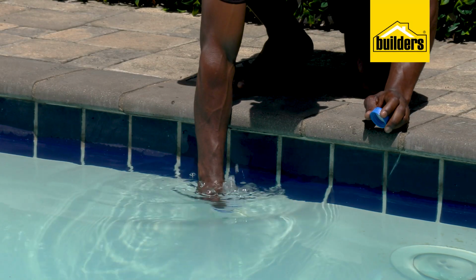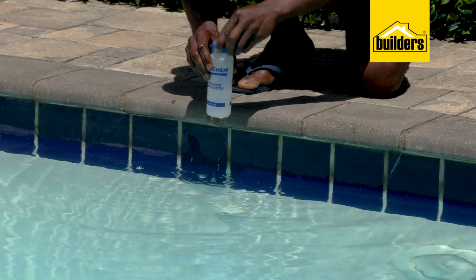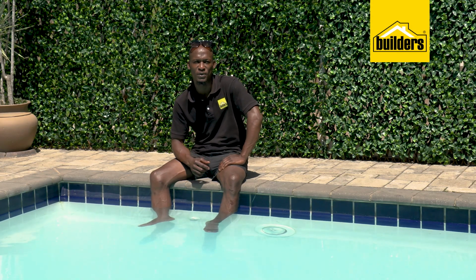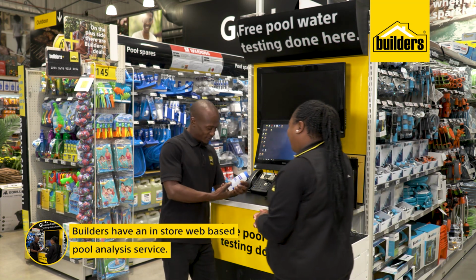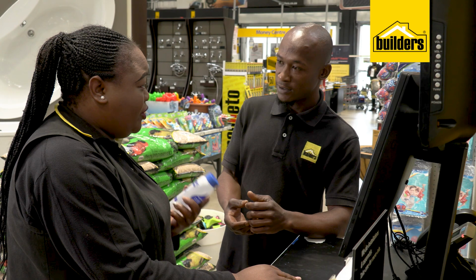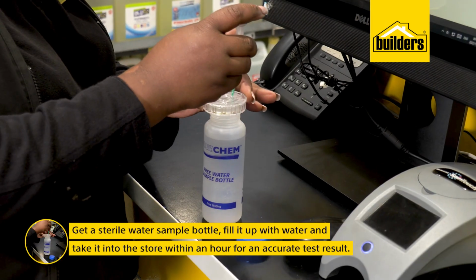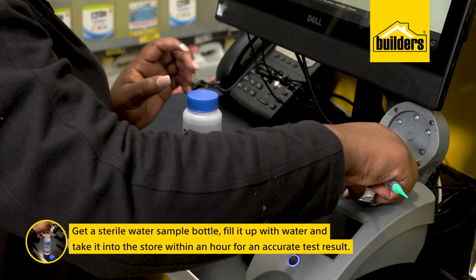Now I'm going to get a water sample tested, but before we do that, let's cover a few basics so we can understand the test with a bit more clarity. Now Builders have an in-store web-based pool analysis service. Just get a sterile water sample bottle, fill it up with your pool water, and take it into the store within an hour for accurate test results.